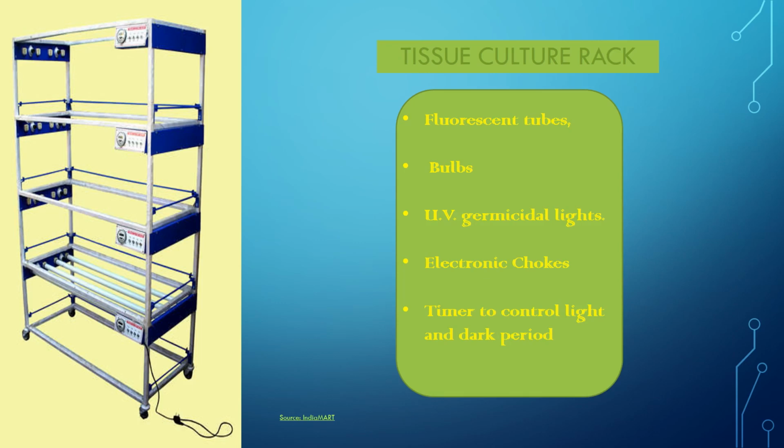Now let's see the role of incubation racks in plant tissue culture techniques. In plant tissue culture, the cultures are usually incubated for a long period, extending over several weeks. Additionally, the growing cultures are autotrophic, which means they start carrying out photosynthesis, with the exception of some callus cultures and adventitious root cultures. Thus, there is a dire requirement for light for the photosynthesis.